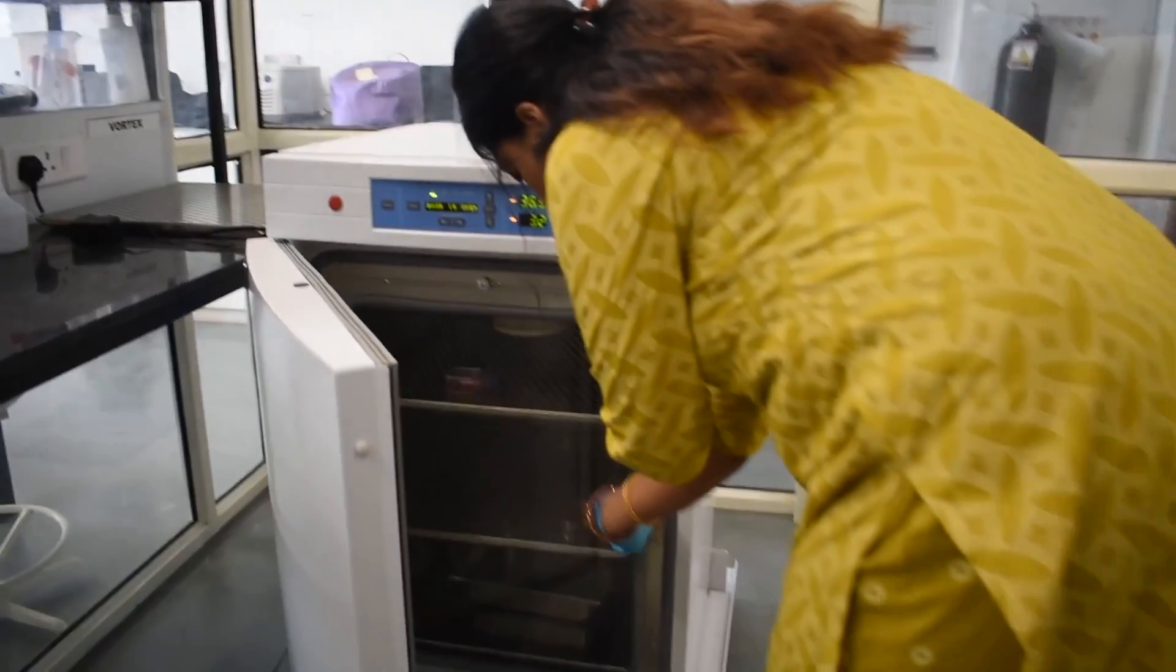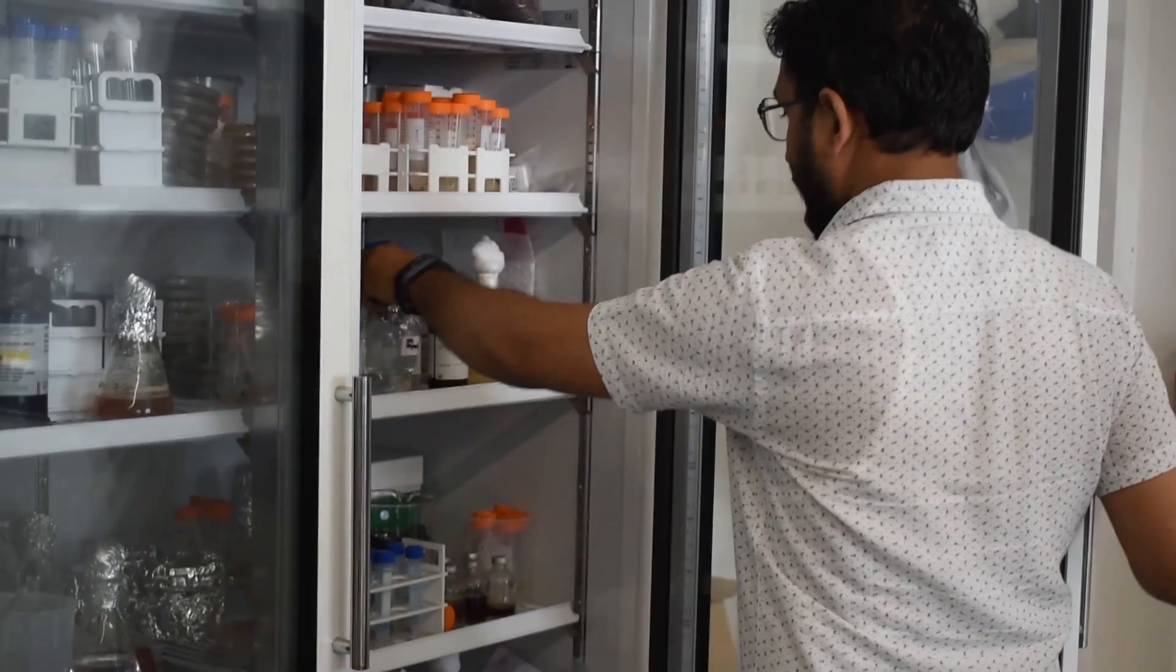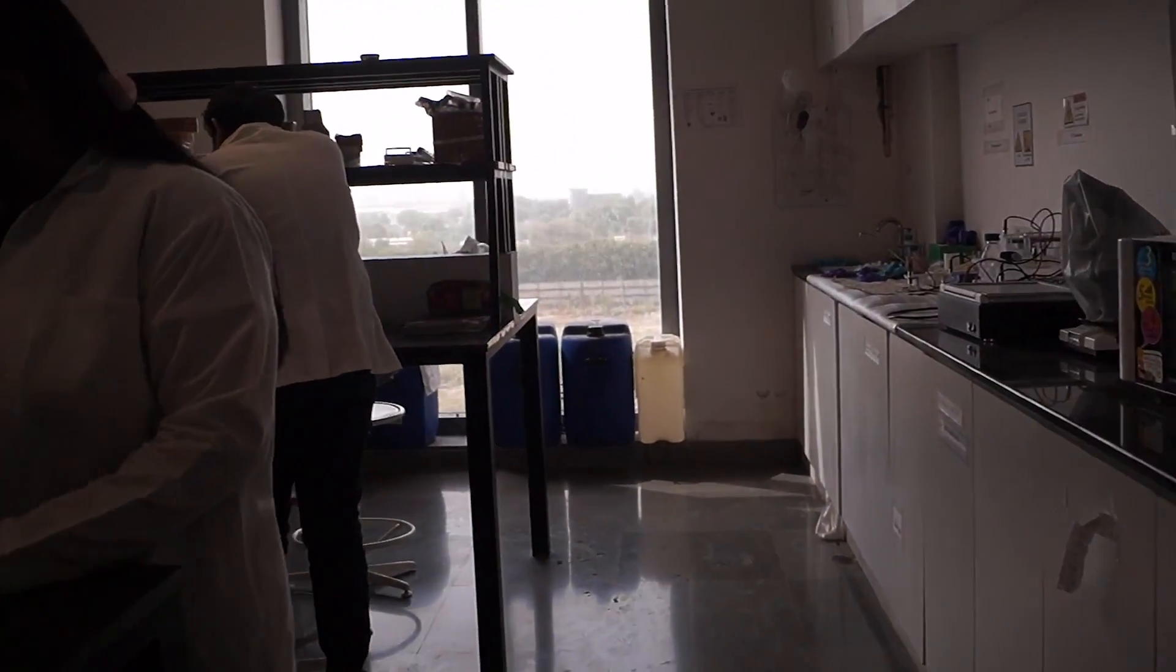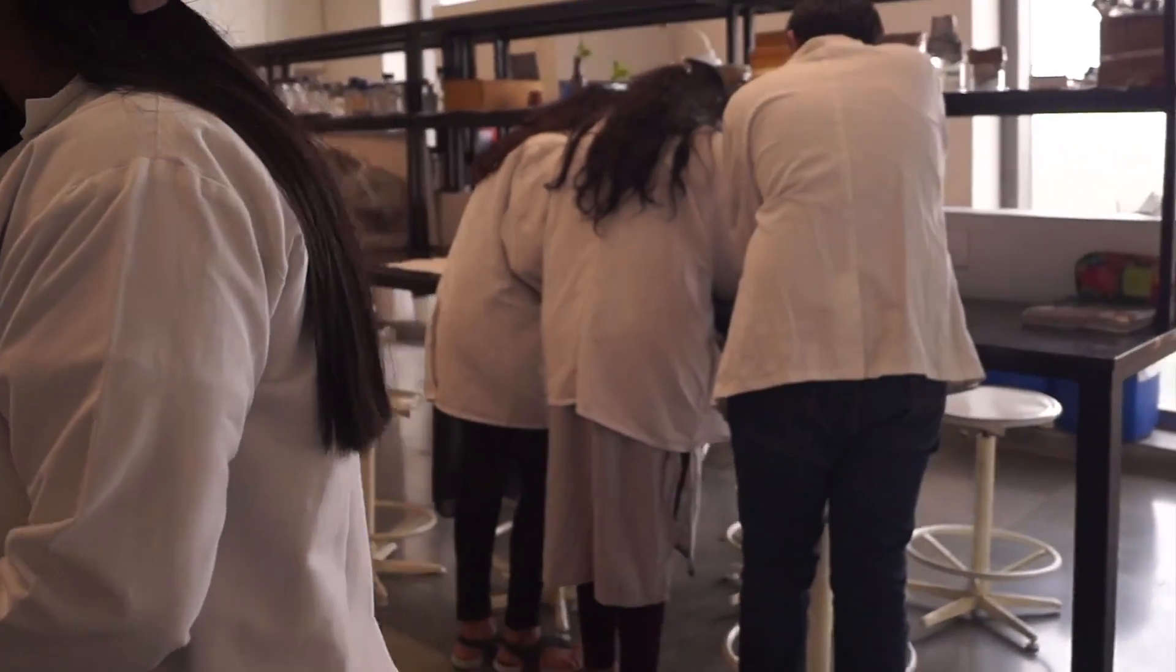The bioprocessing lab facilitates students in conducting the production and purification of biotechnological products. Students get an in-depth understanding of transient transfections and stable clone generation.